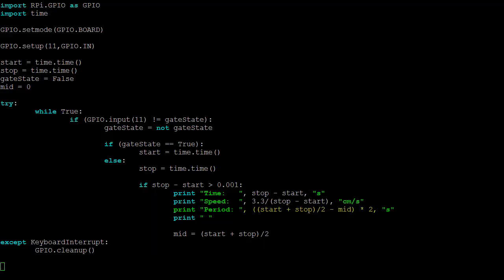A simple extension to the program is to set it up for analyzing the period of a pendulum. For this, we need to calculate the time when the object is in the center of the gate, which I've called mid. This can be calculated by taking the average of the start and stop time.